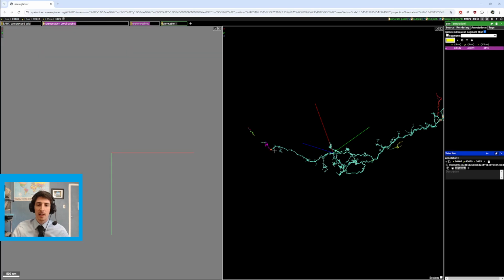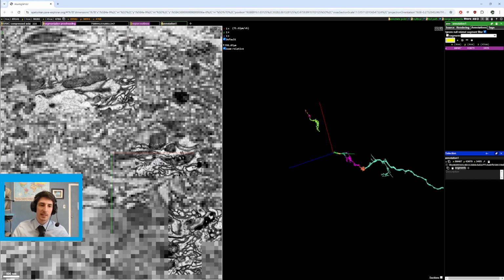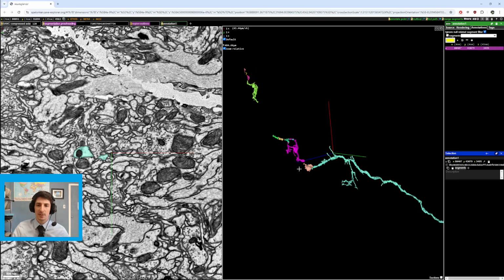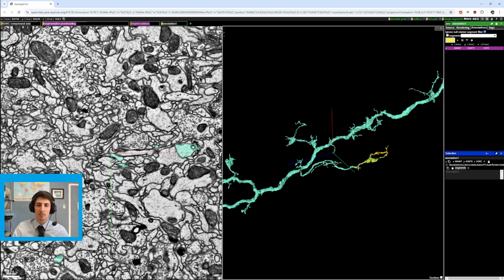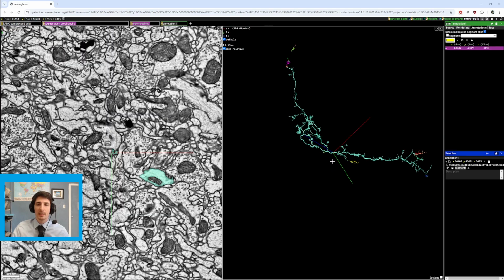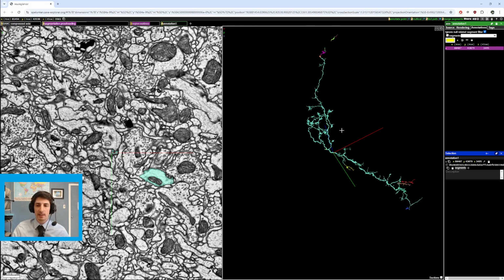and I believe these had all terminated too. It's a little bit difficult to trace in this area, which is why there are some big gaps. But these are kind of thin, and you want, like I said, medium to smaller, but usually medium branches. Now we couldn't find it on either side, so that kind of leaves this middle area.